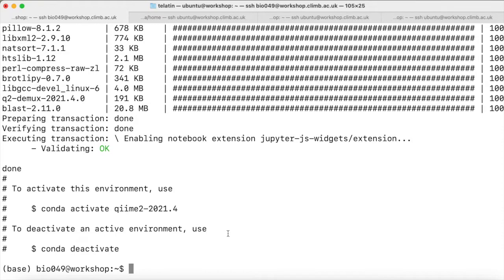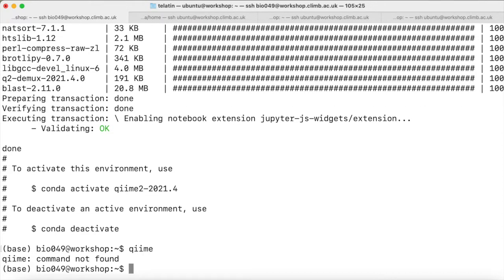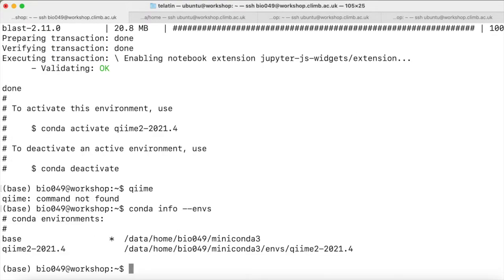Now, if we try to run QIIME, it won't load because it has been installed in a dedicated environment. To list our current environments, the command is conda info --envs. We just created a QIIME 2 2021.4 environment, and to activate it, it's just a matter of running conda activate qiime2-2021.4.